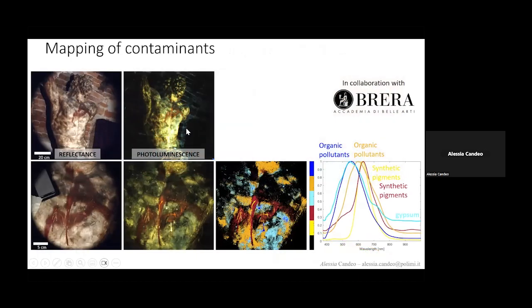Thanks to the high light throughput of the system, as I previously mentioned, it is possible to perform fluorescence experiments even on large fields of view with highly three-dimensional objects. This is because we can close the diaphragm of our objective while still having a good signal-to-noise ratio.